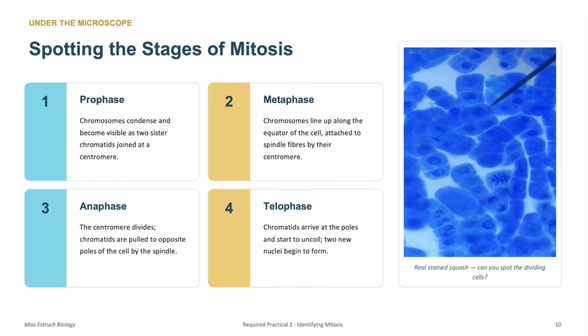Now, if you do this experiment and you manage to see any cells in mitosis, congratulations, because most people don't manage to achieve that, including teachers. To the extent that whenever we do, my friends and I always send each other a photo, and that's actually what this is. This is from one of my teacher friends, Mrs. Egan, and she managed to get this image where we can actually see here the cells in metaphase, cells in anaphase as well, and potentially some cells here in prophase.